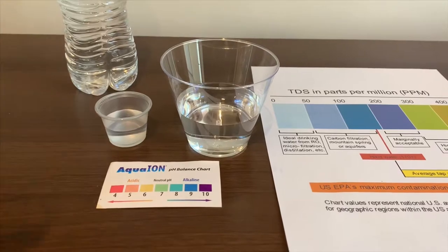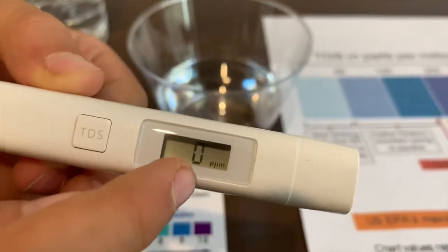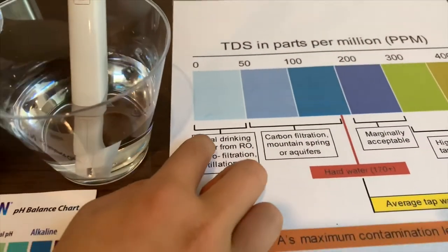First, we're going to test the TDS level. Turn on the TDS tester, make sure it says zero, and let's put it in. Two — that is ideal drinking water.